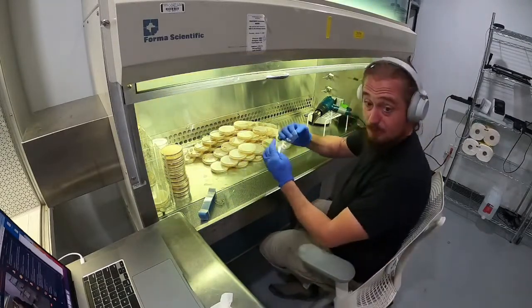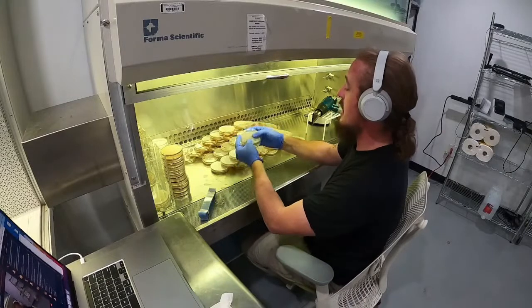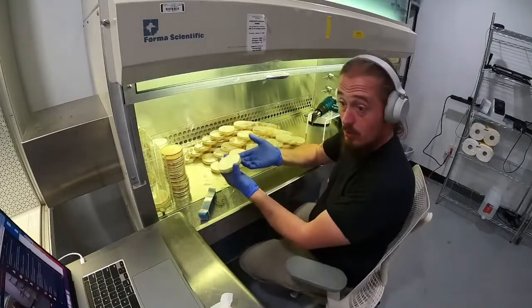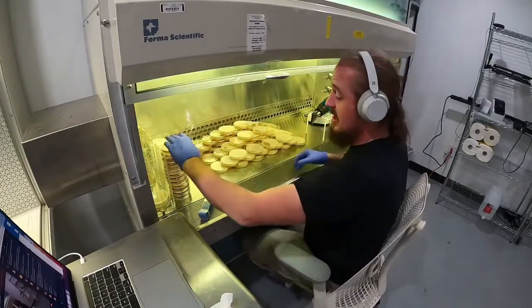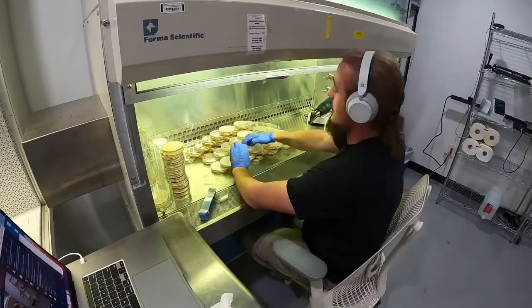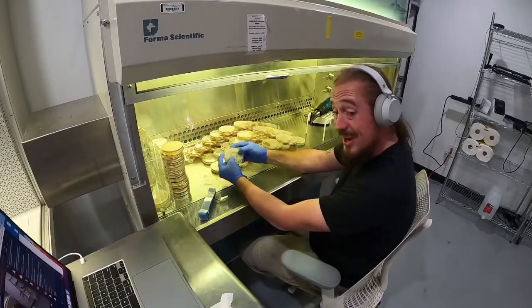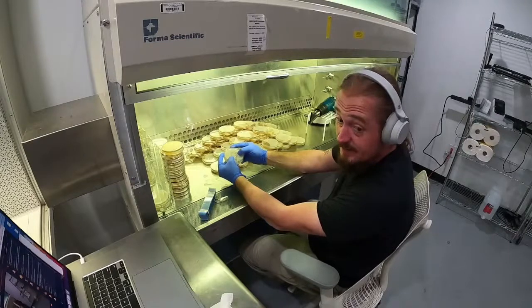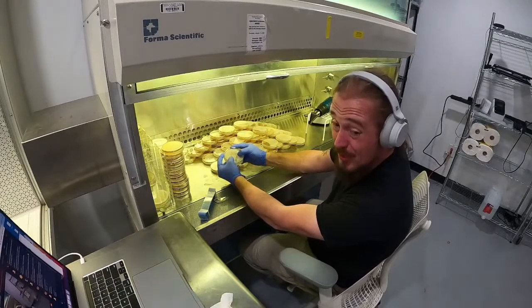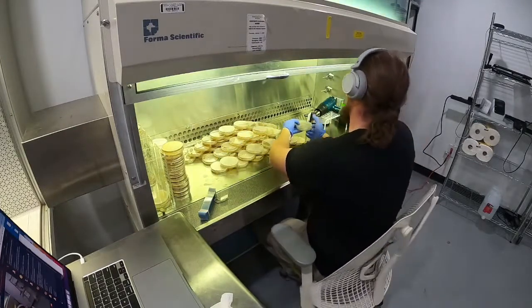The reason why I never apply spores directly to grain is because I don't want any bacteria, contamination, or anything else to outrace the fungus I want to grow, right? So let's say that I have a multi-spore syringe and I inject it. There's a very greater than non-zero chance that that's going to just contaminate. The reason why is you just injected new moisture into a static environment, e.g. the grain bag, throwing everything out of whack. Now you have to wait 2 to 3 weeks for those spores to germinate in that bag. Faster if you're lucky. Right?